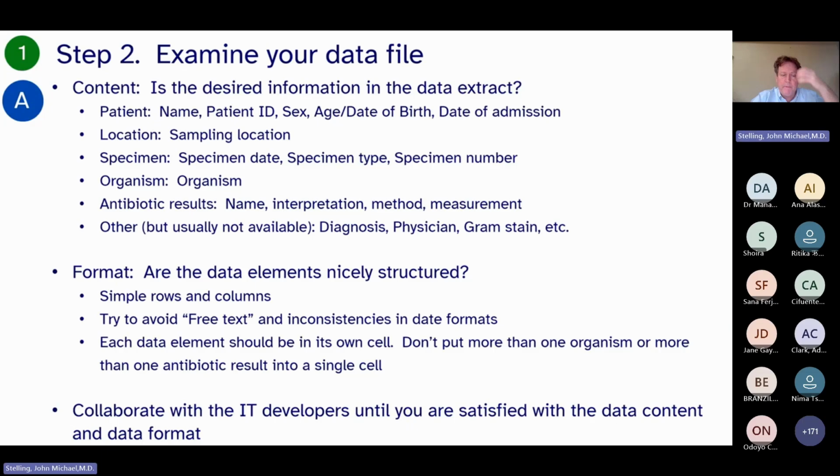Also, date formats, I've seen with Excel, it often depends on who's entering the data. Some people put month, day, year. Some people put day, month, year. Some people put year, month, day. And in Excel, it's mixed up. So they're actually corrupting the data because different people enter the dates in different ways. Some people put the word January 2nd. So you want the data to be clean to avoid some of these annoying problems and data corruption.